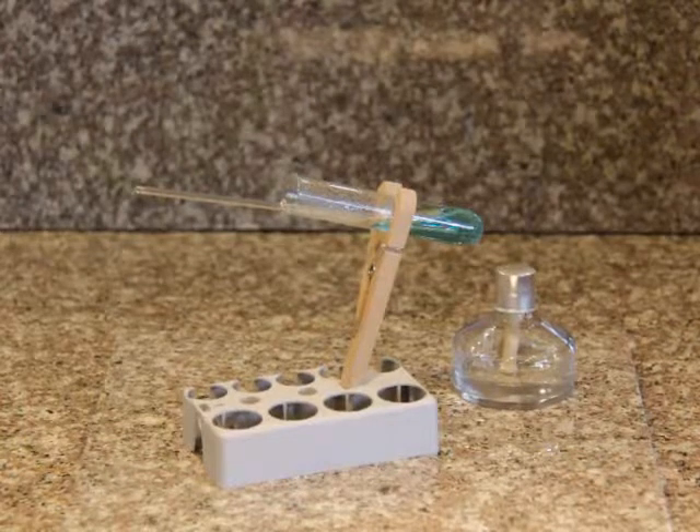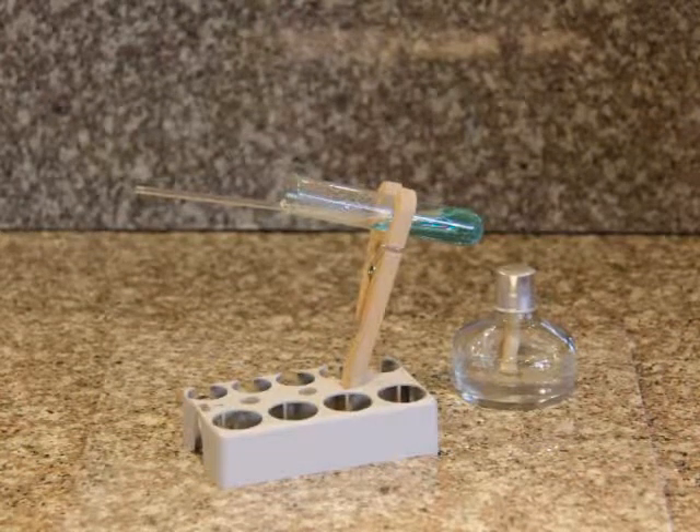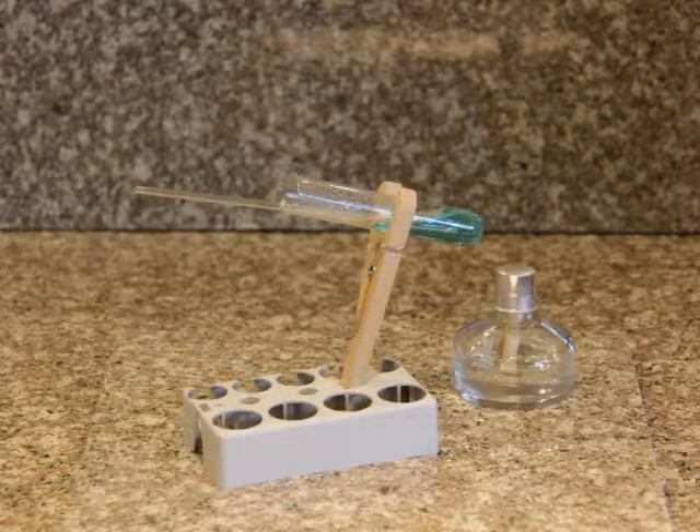Now you have a copper sulfate solution. You will need this for experiments 11 and 13.